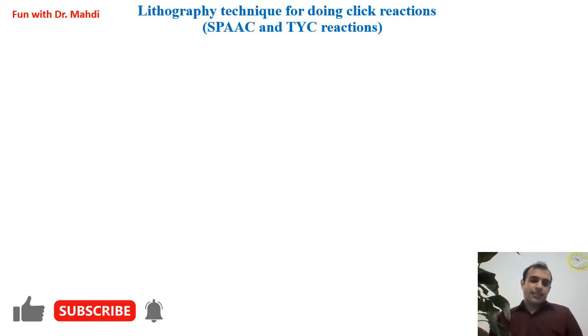But in this study, as I already mentioned, we would like to use lithography for printing the molecule on the surface and doing click reactions and also protein immobilization. First, I would like to start with a click reaction. We would like to print the molecule to the surface and do two different types of click reaction. As an example, I have selected SPAAC and thiol-yne coupling.